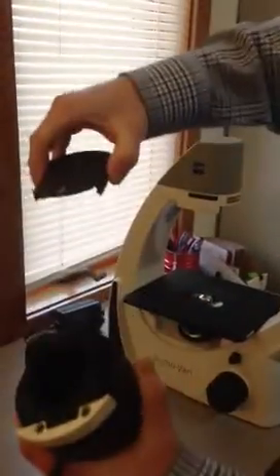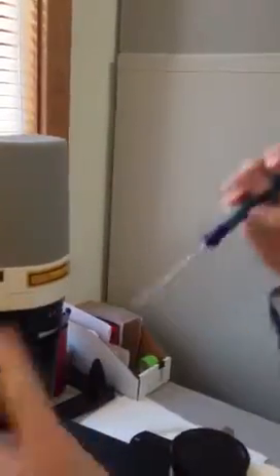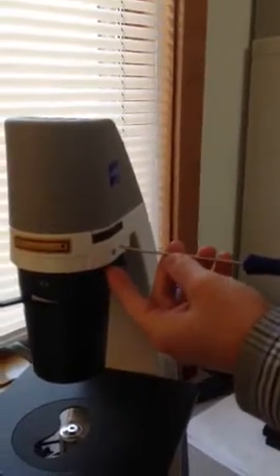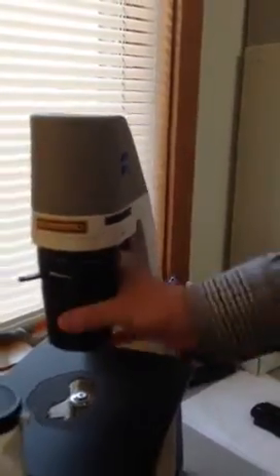Next you can put on your condenser. The condenser has a dust plug on it which you can pull off — save this for later because when you ship it back you just want to slide it back on. The condenser just slides right onto this track here; it lines up and slides right in. On the side right here is what tightens it down — use your wrench and tighten it down. Now your condenser is in there.